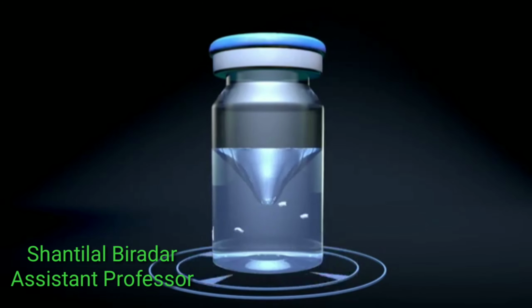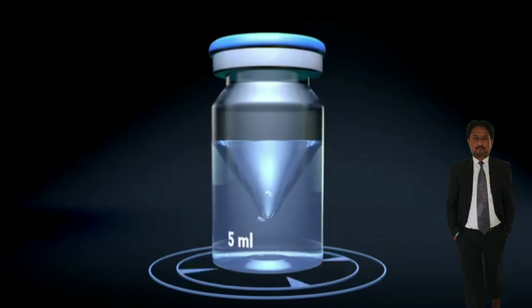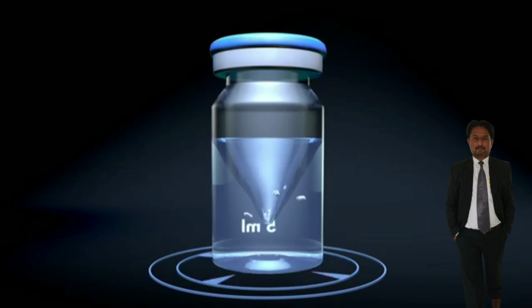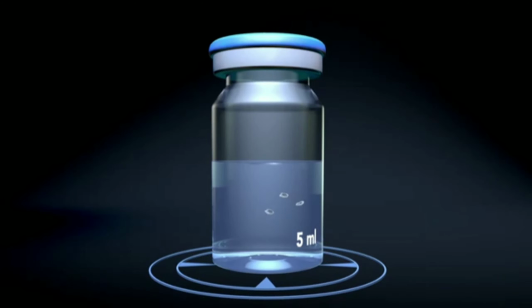The rapid rotation of the container displaces the liquid and sets any particles in motion. When the rotation of the container is stopped abruptly, liquid and particles remain in motion. Markings, scratches, and contamination on the outside, however, are no longer moving.